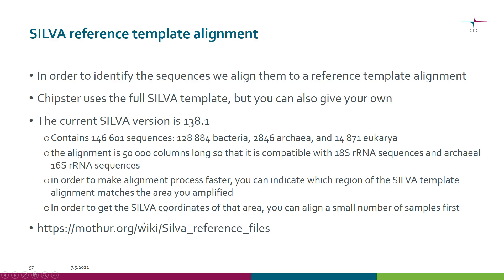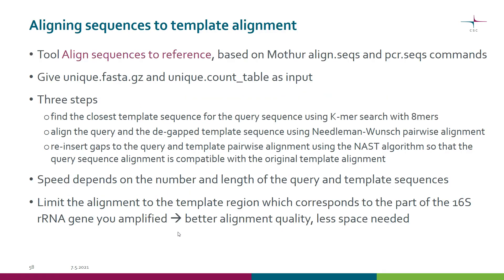If you want to read more about the SILVA reference files, here is a link to the Mothur Wiki. In Chipster, you have a tool called Align Sequences to Reference, which is based on the Mothur align.seqs and pcr.seqs commands.